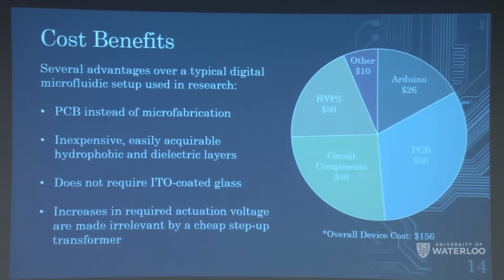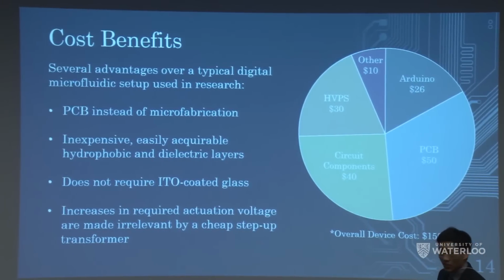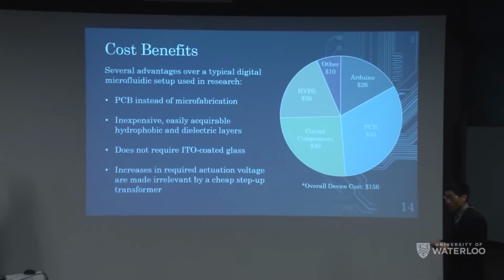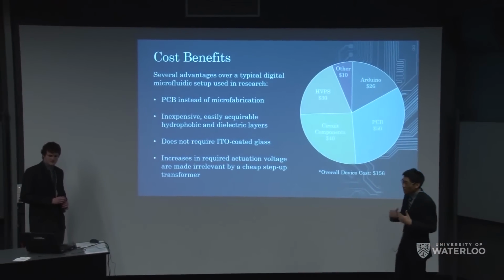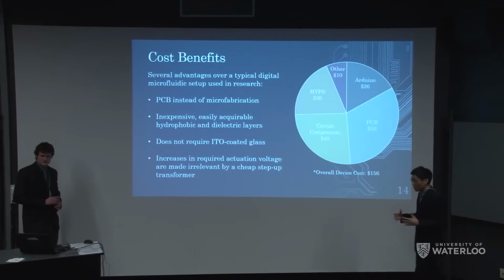But what was actually a more interesting characteristic is that, I don't know if you noticed, but the materials that we were using were all commercially available goods, like just plastic wrap, commercial hydrophobic coating. And this led us to an inspiration for another avenue for our project: if we could do it, you probably can do it too.